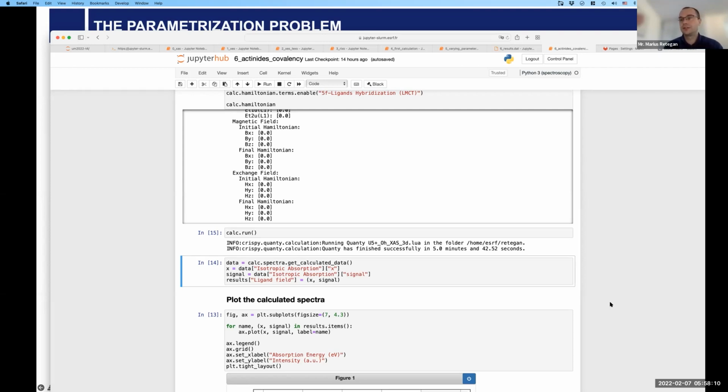Okay. It's already difficult enough to run the experiment. If you go to every synchrotron, every experiment is run differently, which is clear, because every beamline is built differently, but there are the people supporting you, helping you. So if you don't know the command, you can ask the beamline person. Yes. But if you then have to learn it for every beamline and you write down what you did, then it changes continuously. Every next new year, new options and new features.